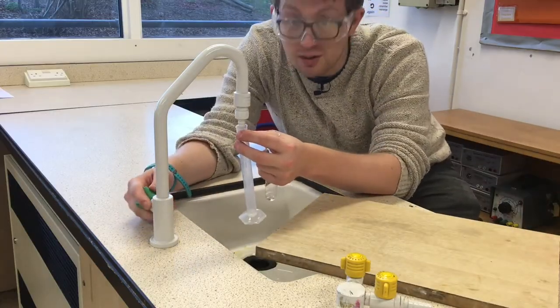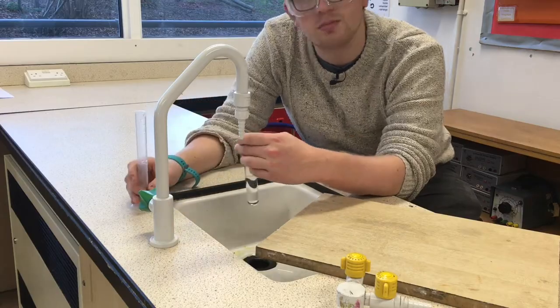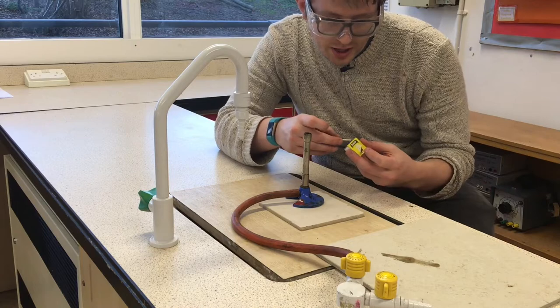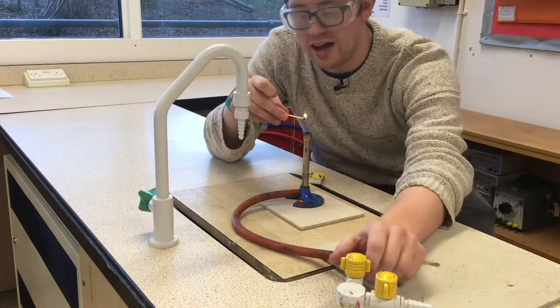I'm going to do that for each boiling tube. With my goggles on, it's time to light the burner. As always, remember to light the match before you turn on the gas.